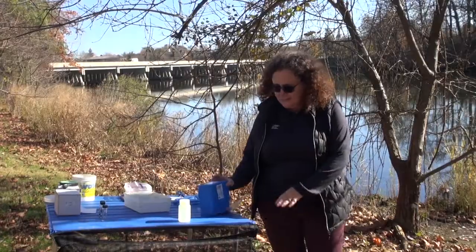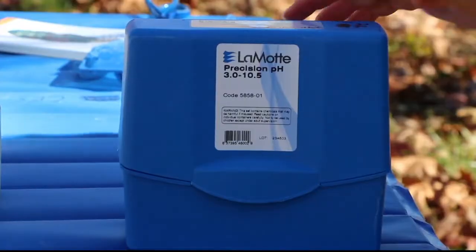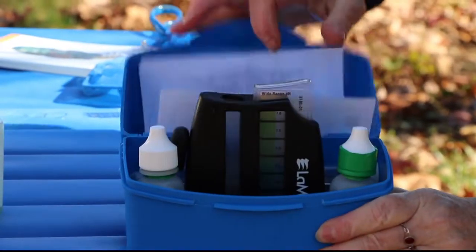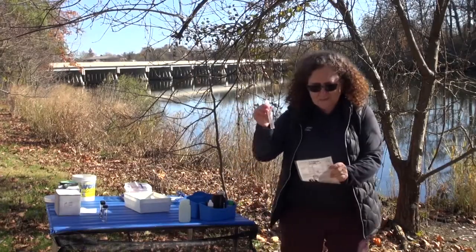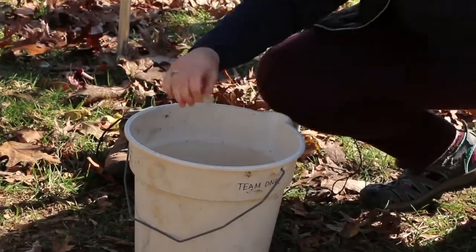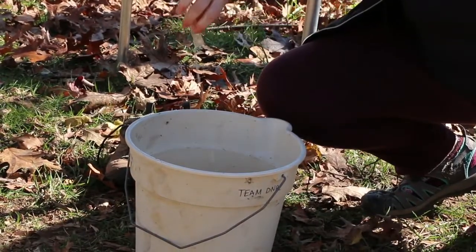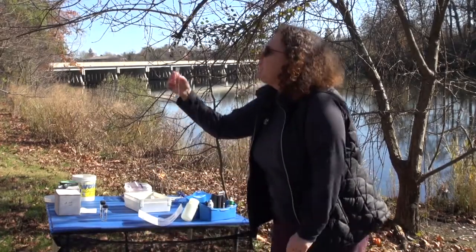To do the pH test kit, I've prepared a sample of water from the creek here. I have my LaMott pH test kit with the directions, which I'm going to be using — they're very simple. The first thing I'm going to do is fill my test tube to the 10 milliliter line with the sample water. It's important to be precise when you're doing water quality testing. I often like to rinse my test tube twice with the sample water to make sure it's clean, and you're also going to hold it at eye level.